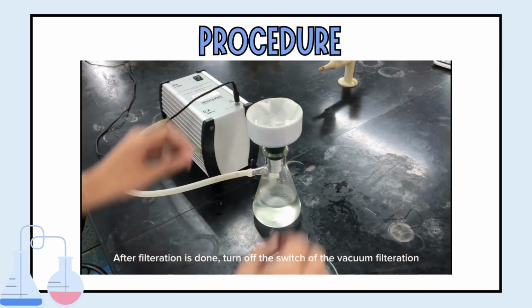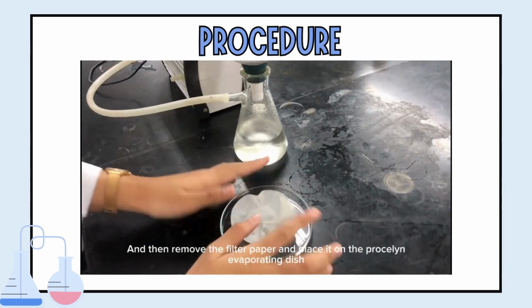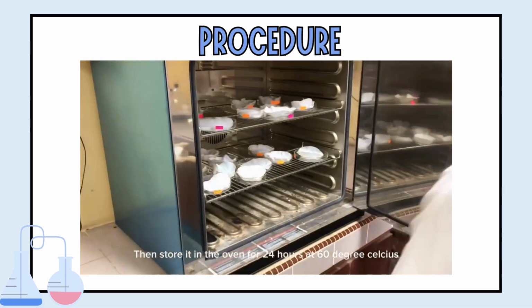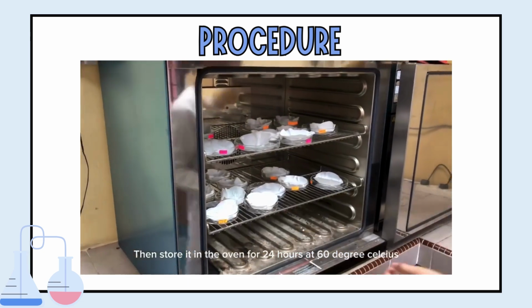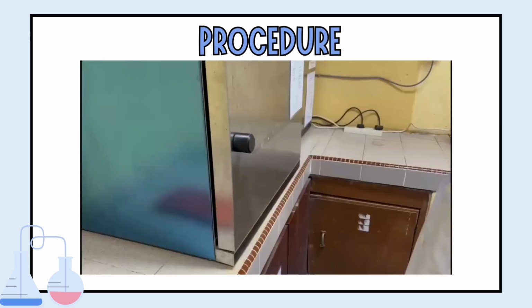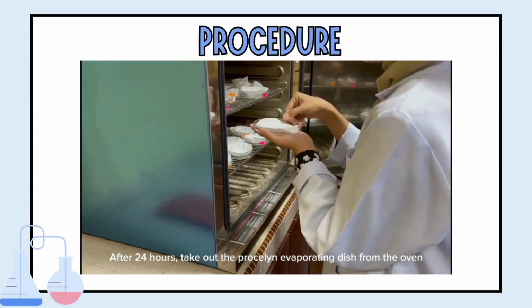After filtration is done, turn off the switch of the vacuum filtration and then remove the filter paper and place it on the porcelain evaporating dish. Then store it in the oven for 24 hours at 60 degrees Celsius. After 24 hours, take out the porcelain evaporating dish from the oven.